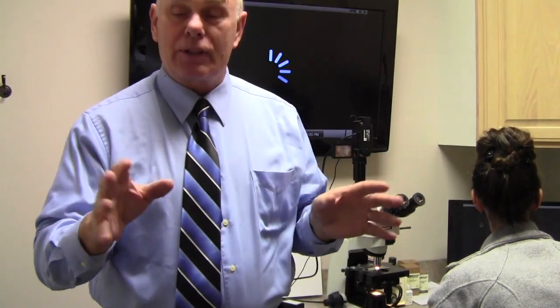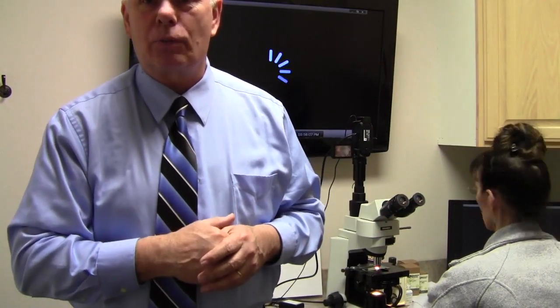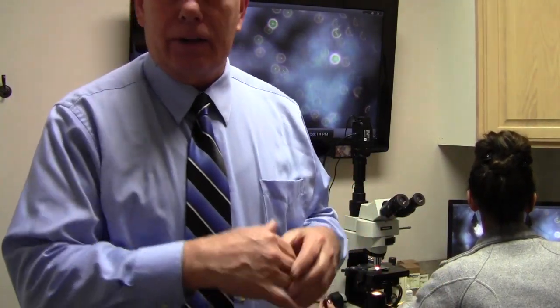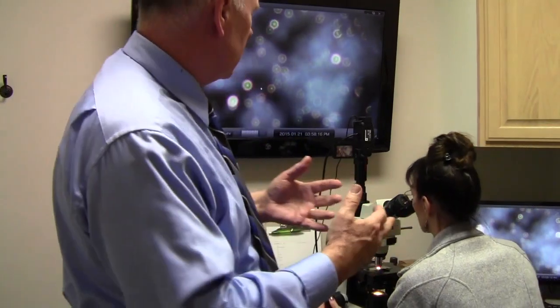Roger Young here. We're lucky to be in the world-famous Dr. West Clinic, and we're with Alicia Ward here, who's our local resident microbiologist, who's operating our 50,000 strength microscope.